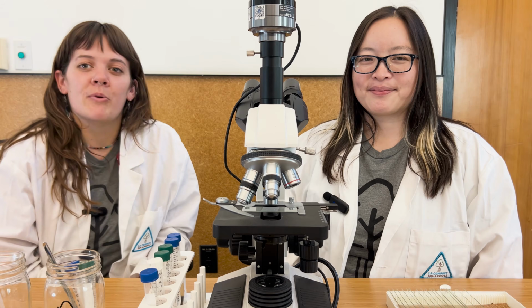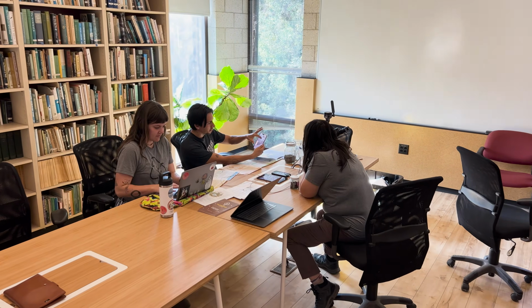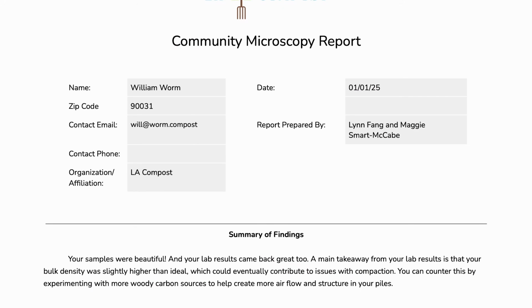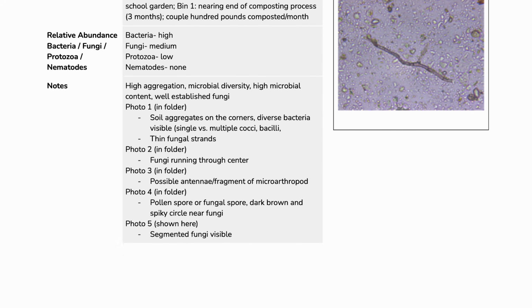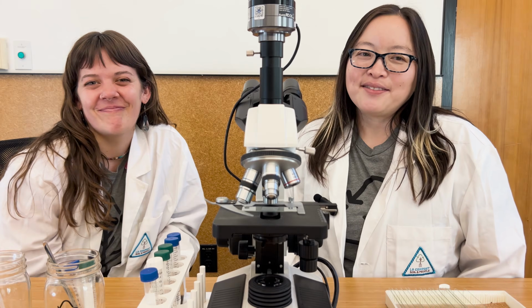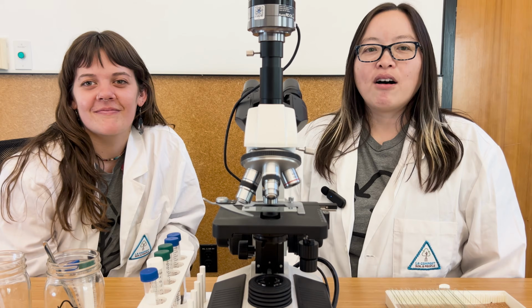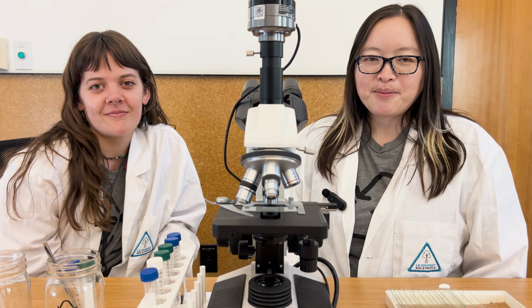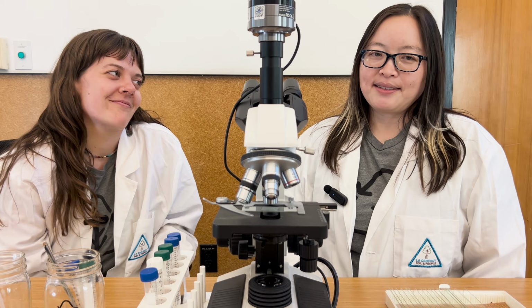It's important to keep a report or log of your findings during a microscopy session to guide your future soil stewardship practices and to watch your soil ecosystem evolve over time. All of our soil microscopy participants receive a report of their findings, and when preparing a report for someone, we typically use this format. We assess the relative abundance of different organisms and provide notes and pictures of each sample analyzed. Although this is a more informal report, it gives participants an understanding of their soil microbiology and next steps they can take to improve their soil health or compost recipes.